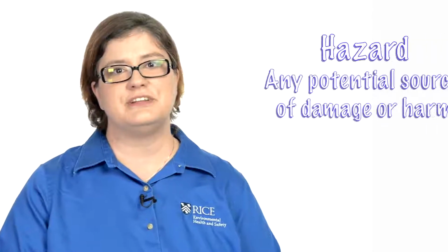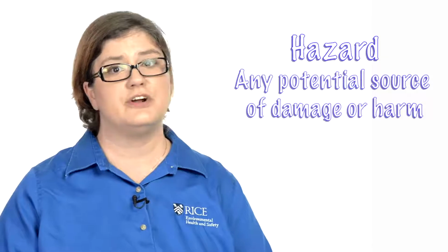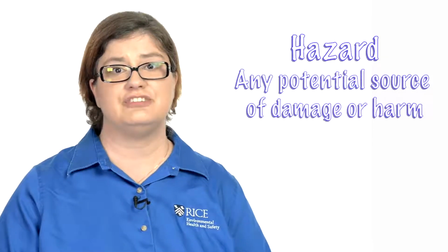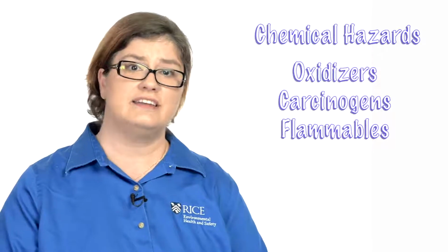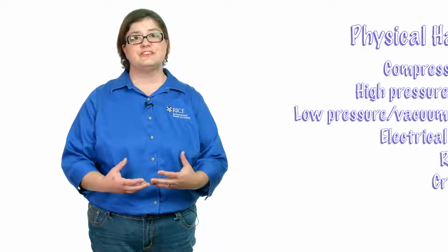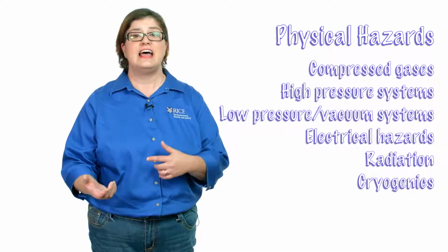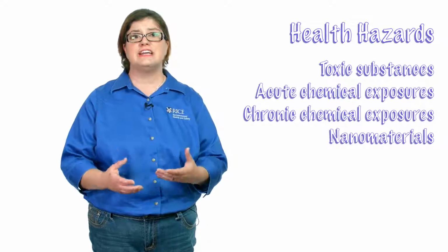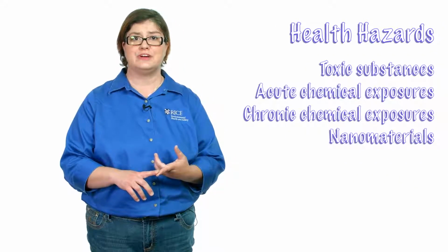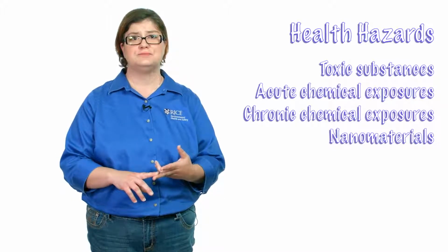A hazard is a potential source of damage, harm, or adverse health effects on someone or something under a certain set of conditions at work. Some of the chemical hazards that you'll find in a laboratory include oxidizers, carcinogens, and flammables. Other physical hazards include high and low pressure vacuum equipment, as well as high voltage equipment. Health hazards include not only acute toxins, but materials that could cause long-term or chronic illness as well.